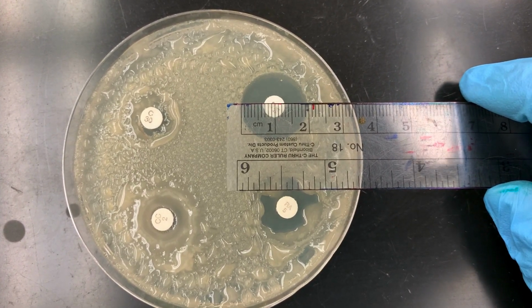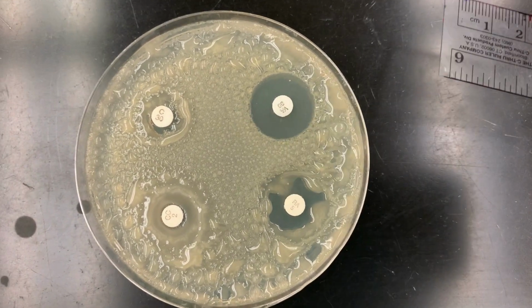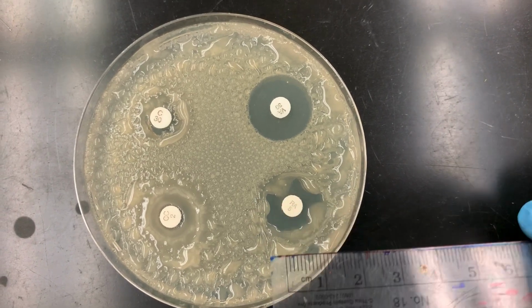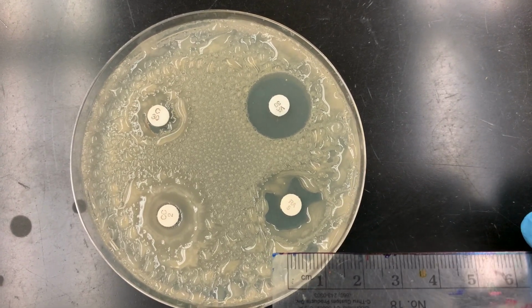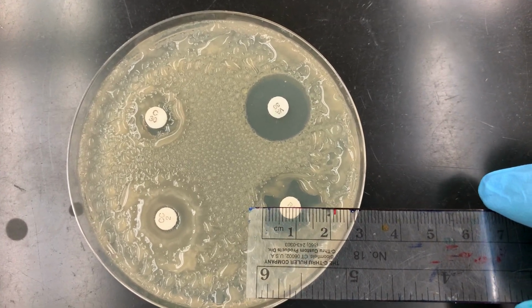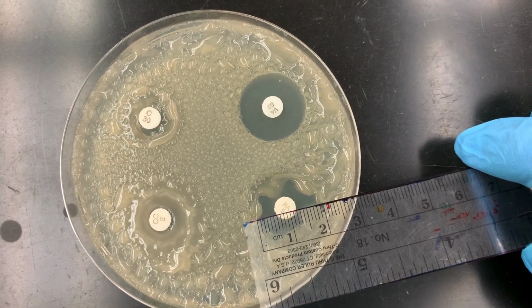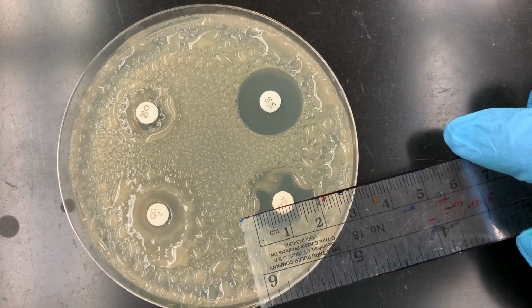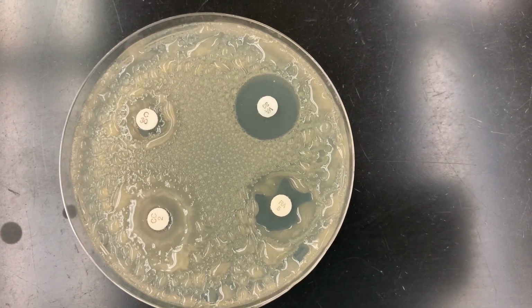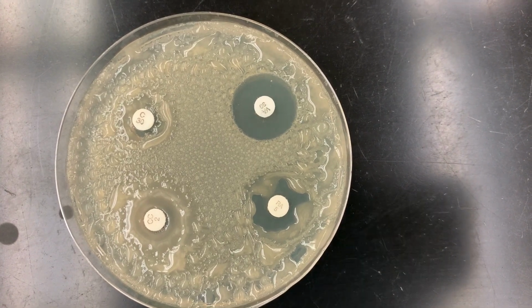So here is your standard gap. Okay. Rifampin, it's kind of weird. You can see this overgrowth in here. That's probably because of the condensation. So I'm gonna hold out and you'll read the diameter of this largest part for rifampin. And again, based on your interpretation, is this bacterium sensitive, intermediate, or resistant?